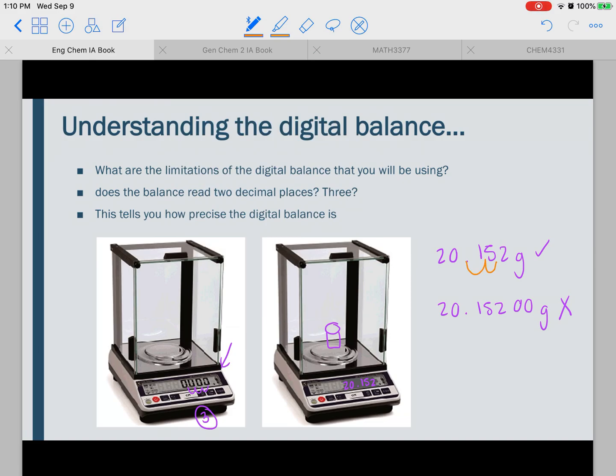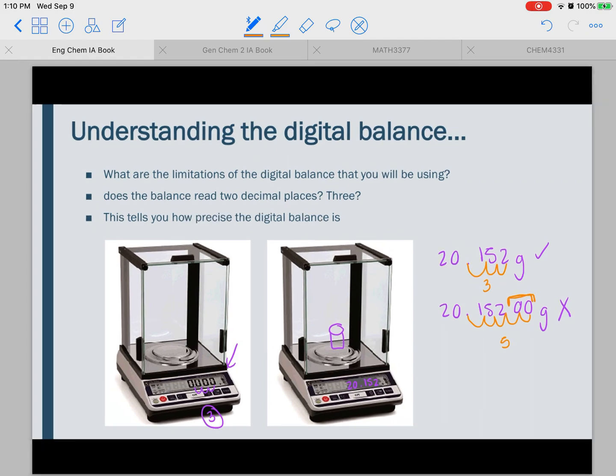What we would not want to write is like 20.15200 grams, and the reason we want to write this one and not that one is because when we look at our scale over here, we see that it's only accurate up to three decimal places. So on our measurement, we only want to have one, two, three decimal places. These last two zeros, we don't actually know if they're zeros. We don't know how accurate that is, and our scale doesn't tell us, and we don't want to assume. So only write down what the scale tells you.